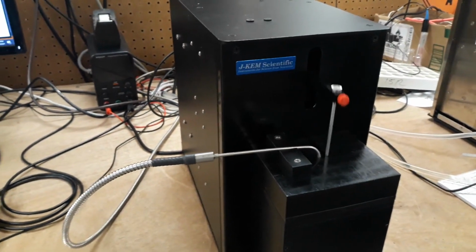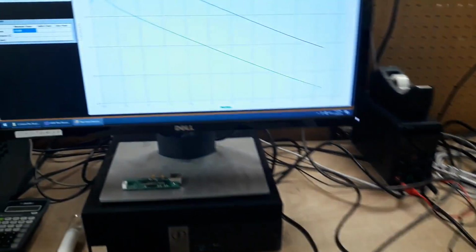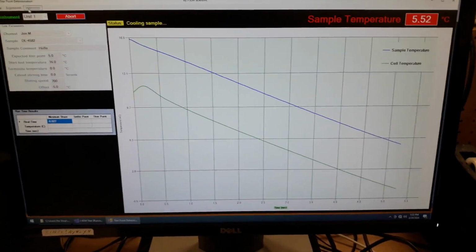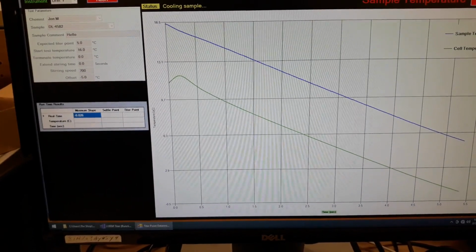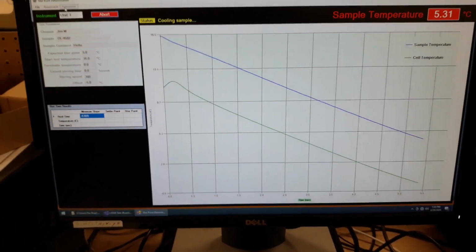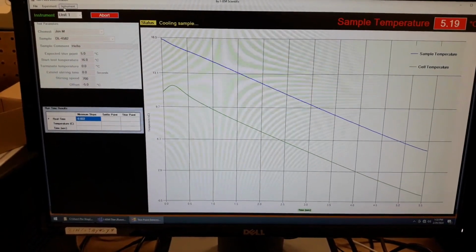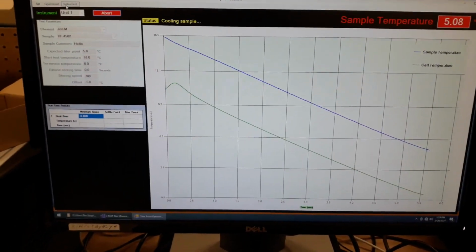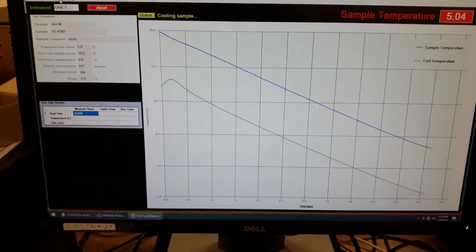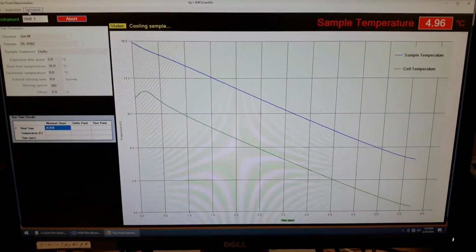So during this entire time, again, the Titer machine has been continuously stirring the sample. Now, when the Titer point approaches, what happens is when the software senses that the slope of cooling is approaching zero, at a certain point, when it gets to zero, the stirring will stop and the stir bar is removed from the sample to allow the sample to crystallize and obtain the most accurate Titer point possible. And now we're approaching that point right now.